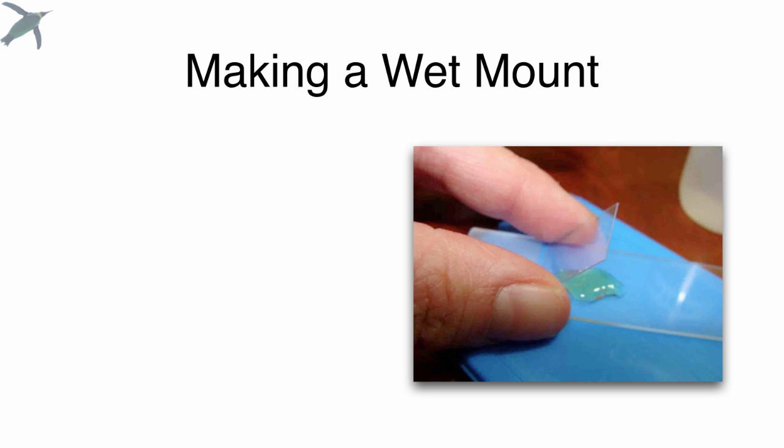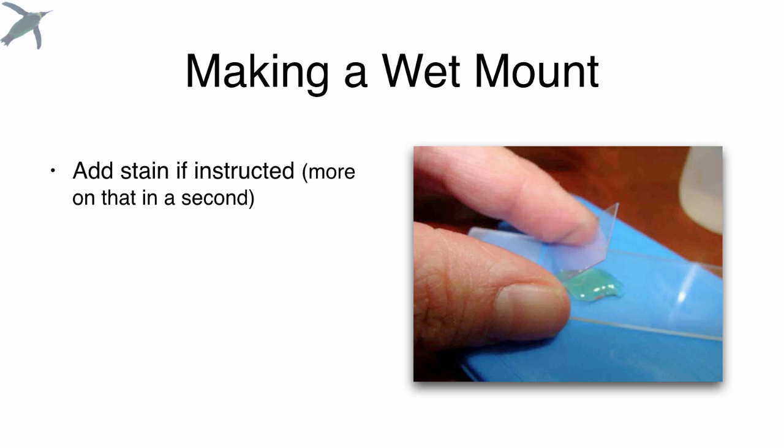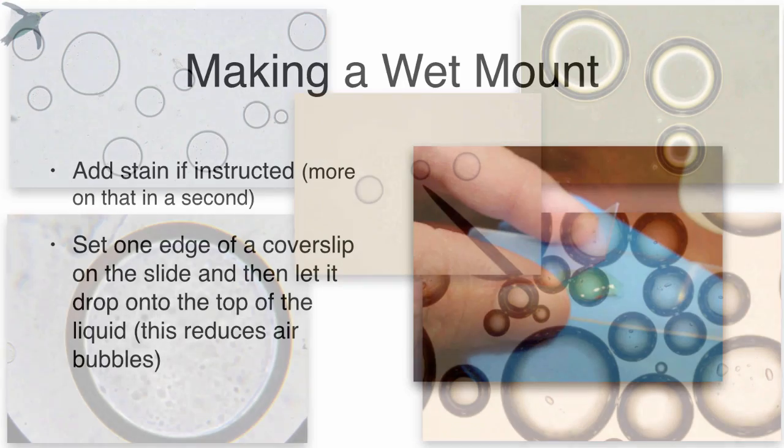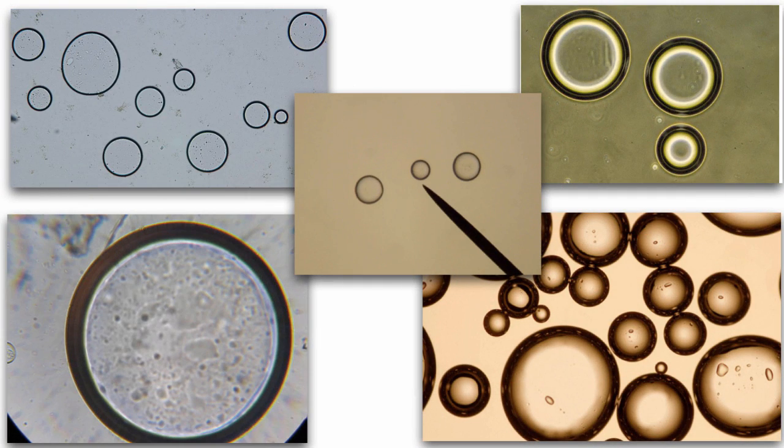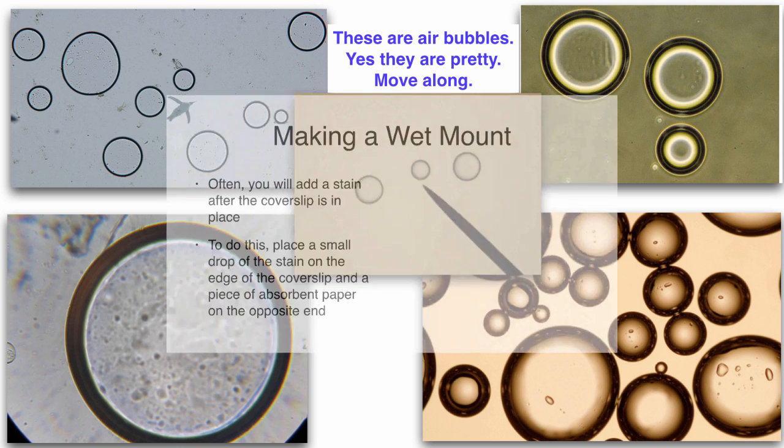Next you're going to grab a cover slip, which is a little square piece of plastic, and add a stain if you're told to do so. But most people add the stain after the cover slip is already in place. Then you're going to set one edge of the cover slip at about a 45 degree angle, and then slowly let it drop. This technique will reduce air bubbles. Now these are air bubbles. Many students spend many hours drawing air bubbles because they look alive, and they're very pretty. Okay guys, they're air bubbles, so just move on.